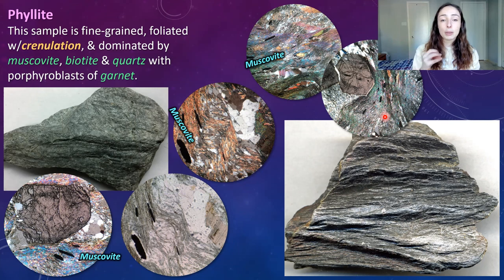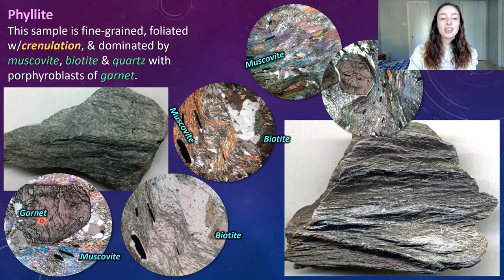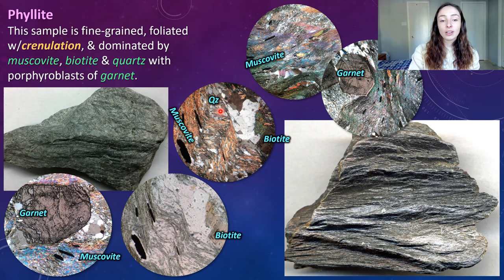If you were to rotate the thin section you'd see the muscovite shining all sorts of rainbowish interference colors. In plain polarized light muscovite isn't a bright color, but the colored micas visible in plain polarized light are typically biotite. Biotite is also this larger clast on the side of this thin section. We also have garnet porphyroblasts — porphyroblasts being just a larger grain in a finer groundmass. We can also see some minor quartz included in this thin section between the muscovite layers.